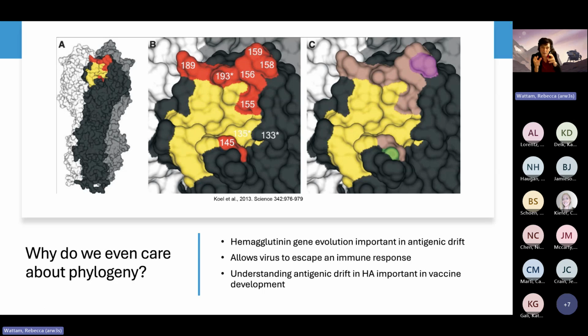It's also the part that you start targeting to create antibodies for in a vaccine. And this little pink spot and this little green spot are the actual places where you're seeing strong evolutionary pressure. You're seeing a lot of SNPs occurring there. So you can even locate exactly where that's happening.